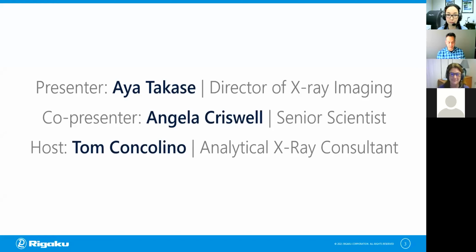Thank you all for attending Rigaku's virtual workshop, X-ray computed tomography for materials and life science. This session is on CT data analysis techniques using Dragonfly. It will take place in the lab, with Angela and Aya reviewing in real time how to use Dragonfly to process scans on a variety of samples.